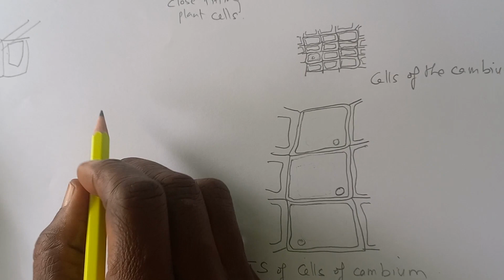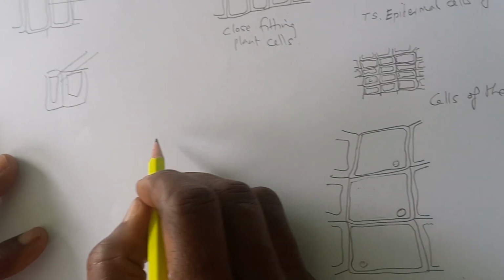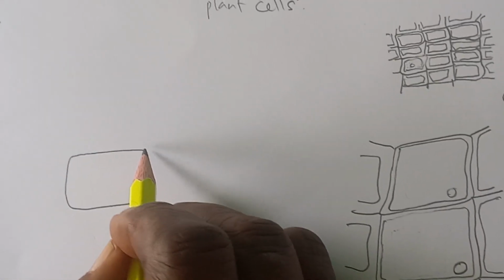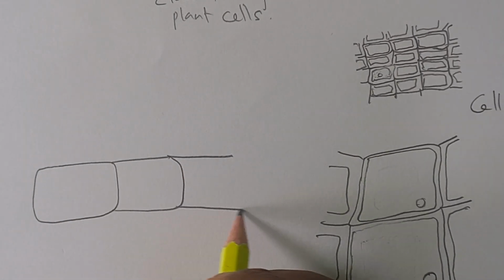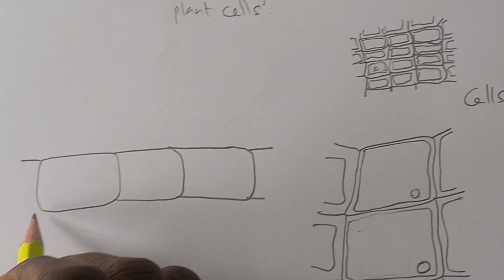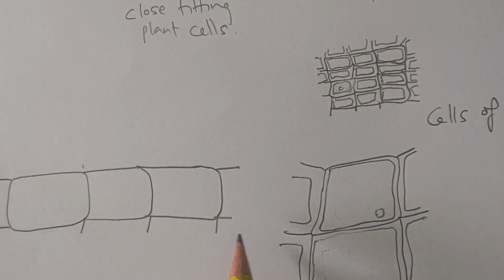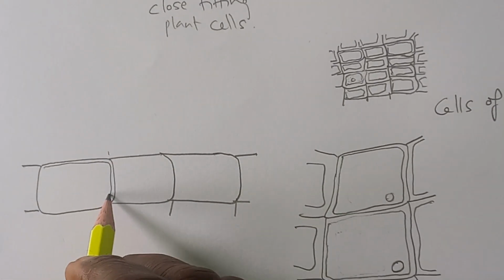Now, if we have a cell like the epidermal cells that we can see and can see the cells with cytoplasm inside them, then the cytoplasm and the nucleus should also be put in, but always outer walls first, inner walls in.